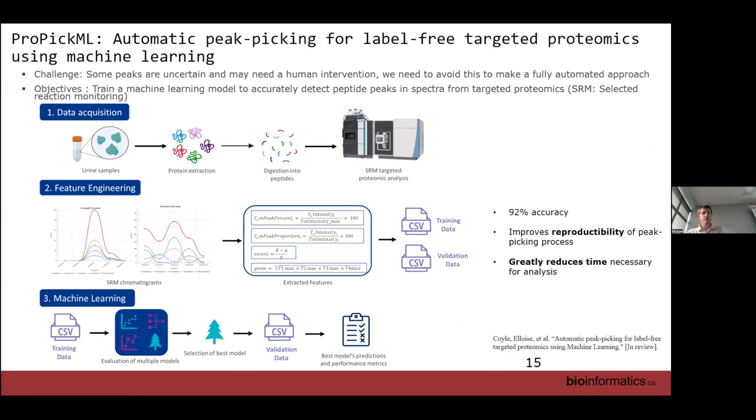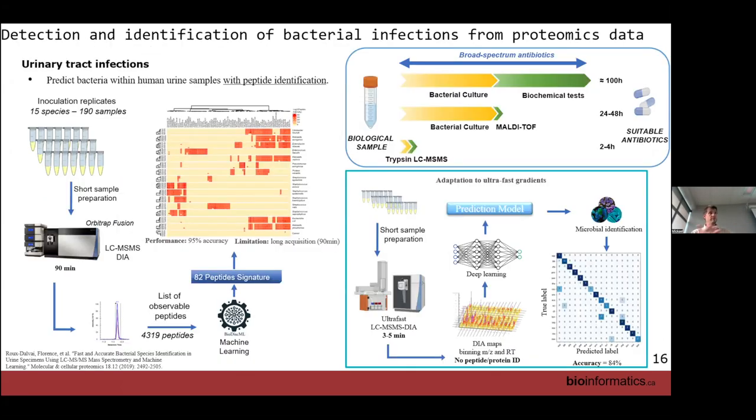She created a lot of data to make a training step and a validation step, and she tried many machine learning models. At the end, we ended with a pretty good accuracy to improve the reproducibility of the peak picking process, and through that, greatly reduce the time necessary for analysis. So these are the tools, and we also have applications.